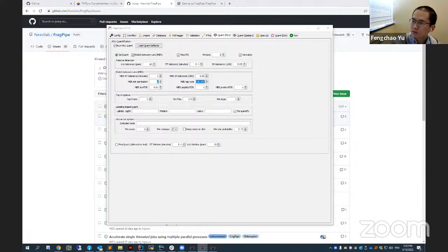Someone sent another error message, saying it cannot find the purity column. Philip, can you answer this one? Yeah, I don't know if you're using the version that we are using from the current release. So let's go all the way to the end with the processing, and then we can show the outputs, and then if we want, we can follow up with your problem.